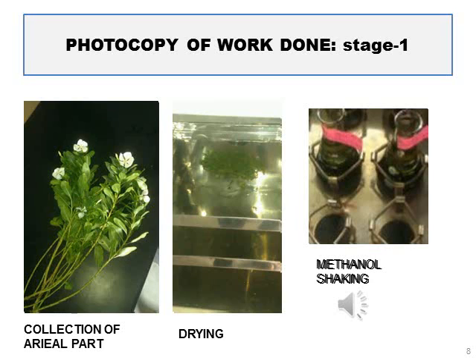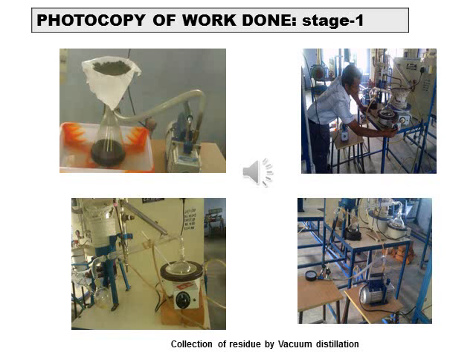The photographs of work done in stage 1: collection of aerial part, drying and shaking, filtration, distillation arrangement, distillations.